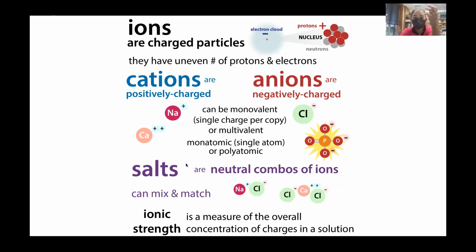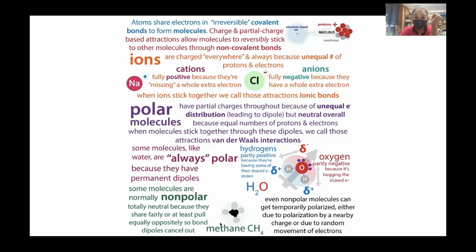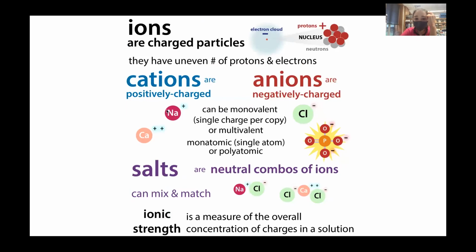But the key thing is that if you have something that's highly polar, like water, it's going to have a high dielectric constant. And this means that if you have charged molecules in there, the water molecules are going to hang out around those charged things. Because remember, water is highly polar because it has these partially charged regions. And so partially charged regions are going to like fully charged regions. So they're going to be attracted to these salts and these ions, and they're going to coat these ions. And then they're also going to coat the RNA.